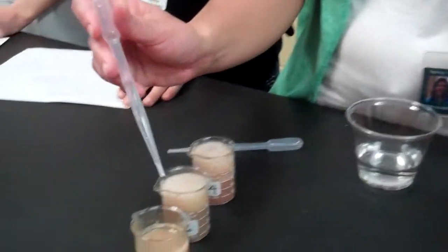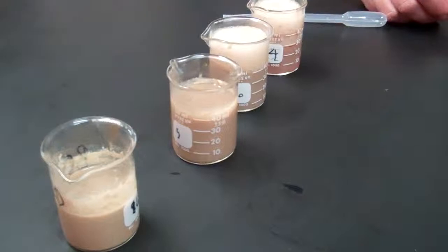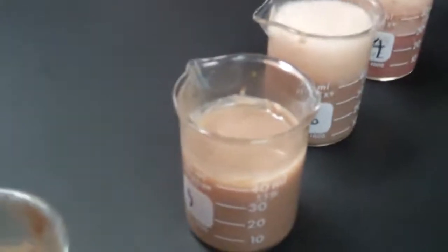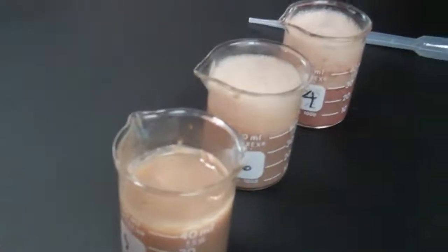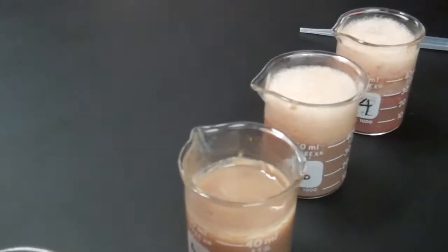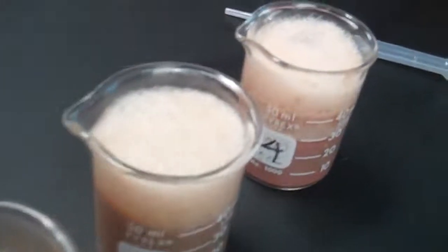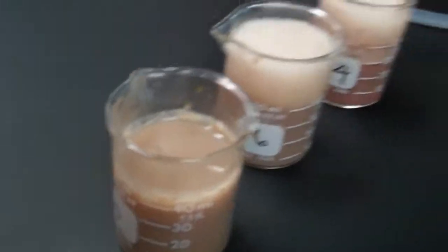Here we go. Oh, nothing. Well, it swirled, but why did it swirl? Because it was a new liquid. Because I squeezed the stuff out of it, and so the pressure of it made it swirl. So really no reaction, right? Yes. This is hydrogen peroxide.